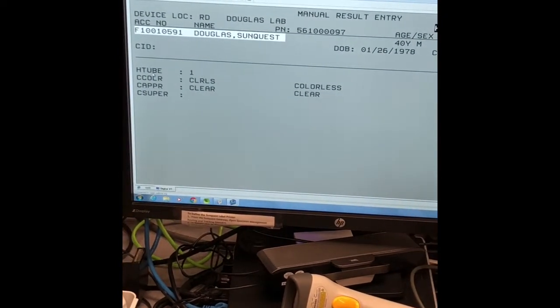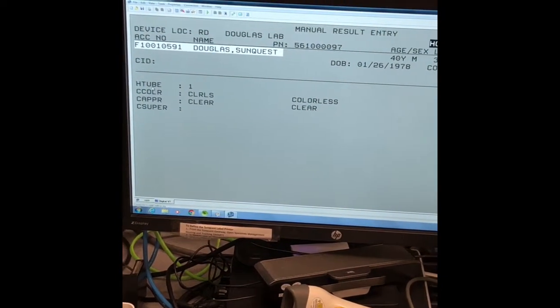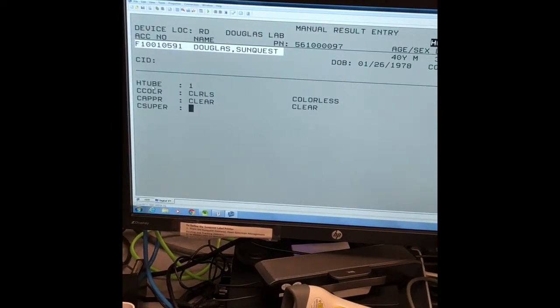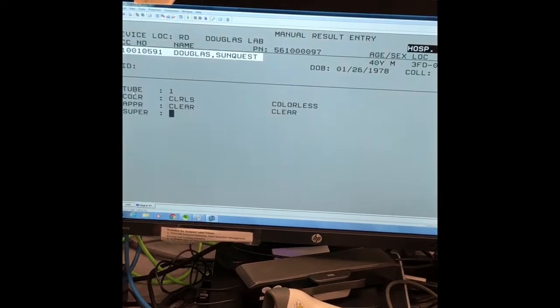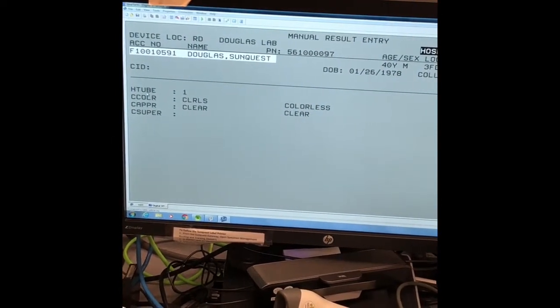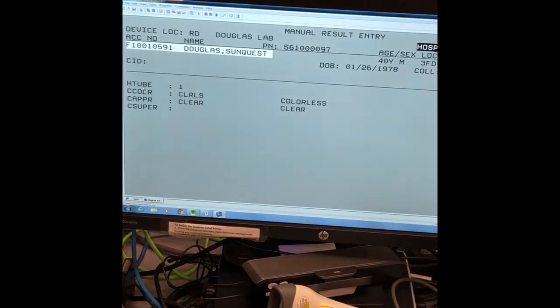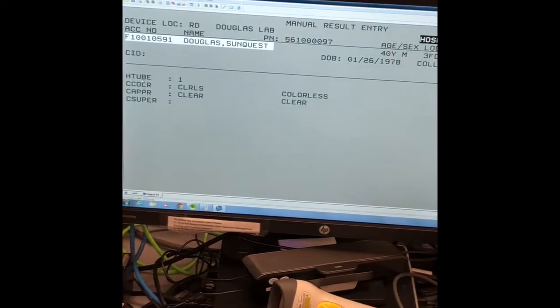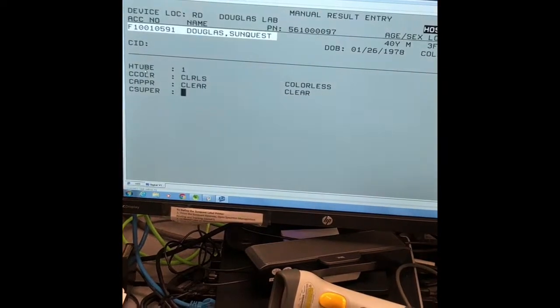So they can correlate from the beginning of the picture. When they ask for an extra, 4 will be that extra count. Sometimes the doctor says, oh my gosh, I messed up the numbers, 3 is supposed to be 1. Just call in and say they made mistakes and it's fine. They probably collected by mistake, beginning with number 3. So that's the reason they say, no, I just want number 3. Maybe that's because it is. But most of the time you will say 1 and 4.